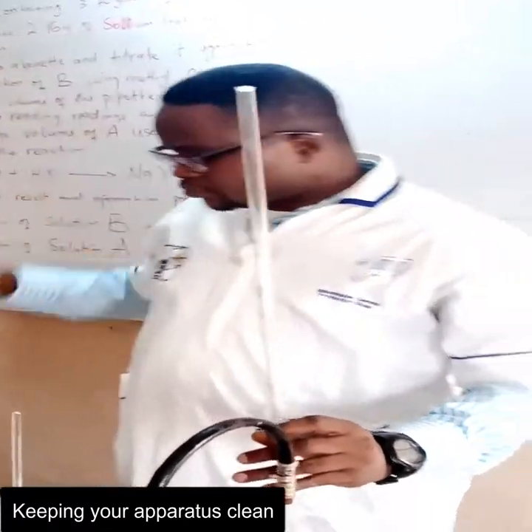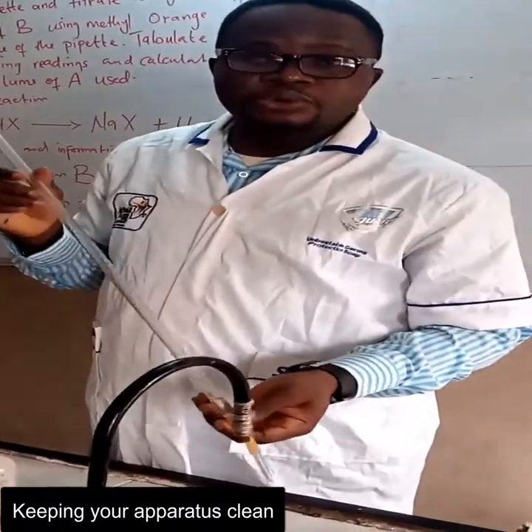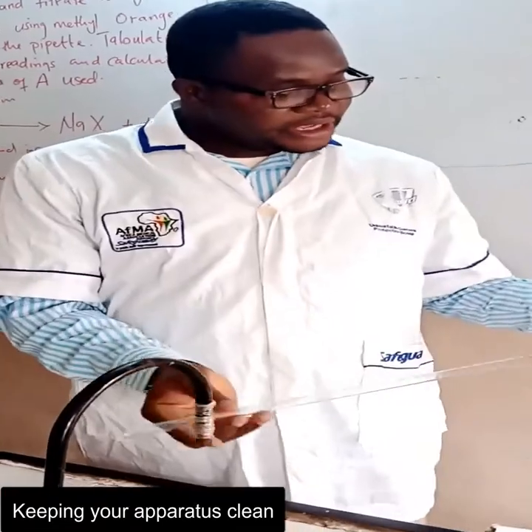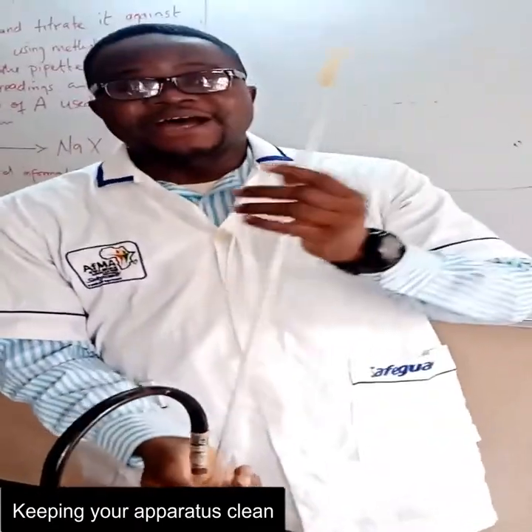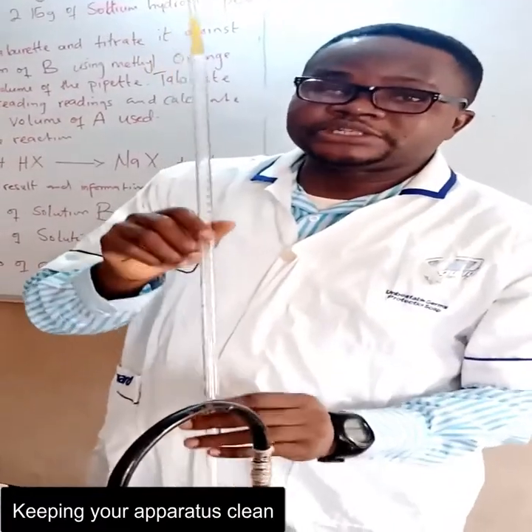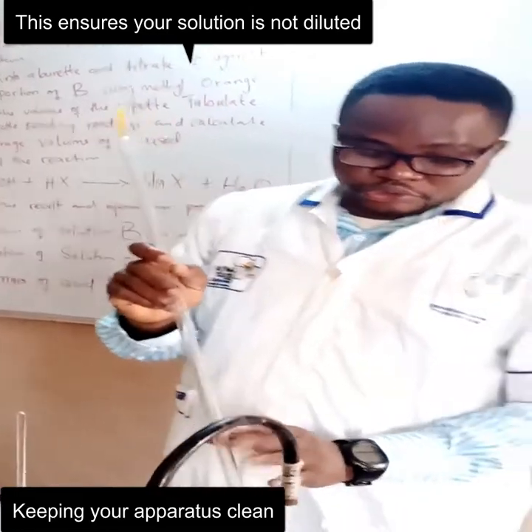The rule is: rinse your buret with the liquid the buret is to hold — that will be the last liquid you use to rinse your buret. The reason we are doing that is not to over-dilute the solution. That's the reason, so that you will not over-dilute your solution.